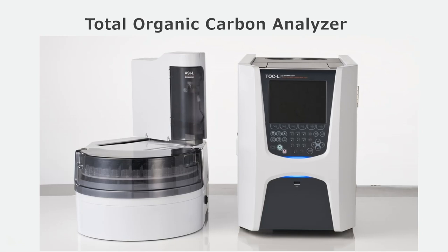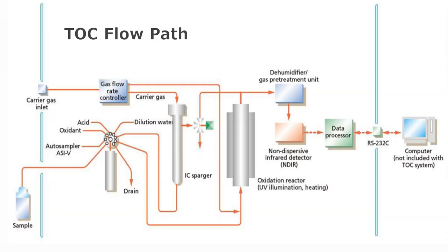TOC stands for total organic carbon analyzer and it looks like this. On the left we have our auto sampler with a sample rack and syringe for injecting samples, and on the right we have the TOC analyzer itself, which for the most part is a big combustion chamber. Let's take a look at what's actually happening inside the instrument.